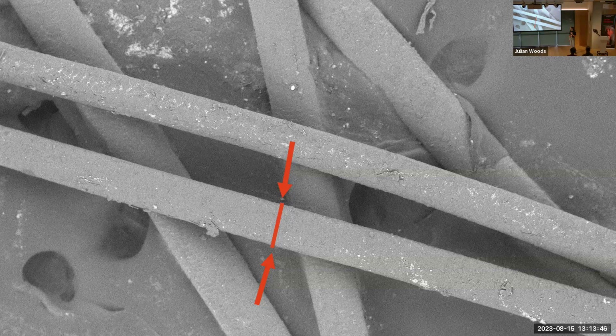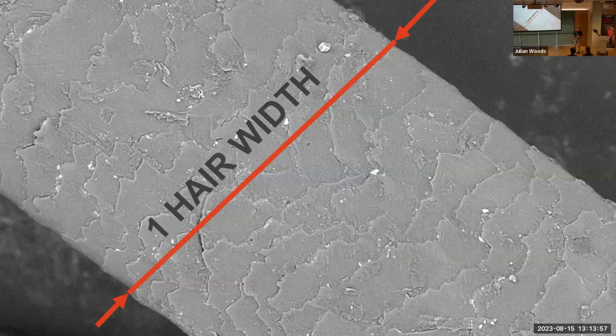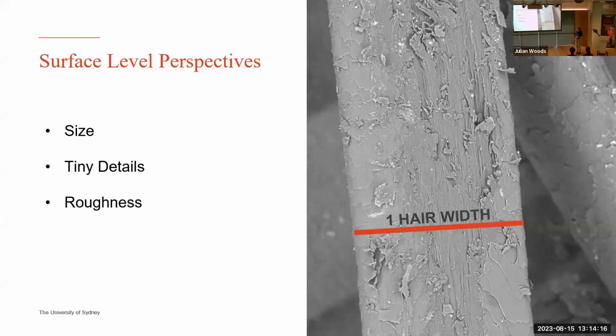It's here. And you can see how small, and we can see dust particles, maybe what shampoo I've been using on these hair fibers. And we can even go in further and see the scales and maybe how the hair was growing and how well it was growing. So make sure you keep your reference hairs on you, okay? You all have them, no excuses. Now we know how big things are moving forward. And we can jump in and look at a few different surface structures.